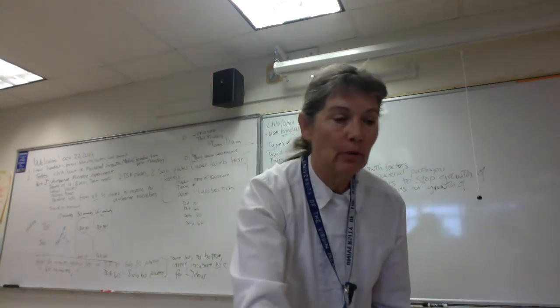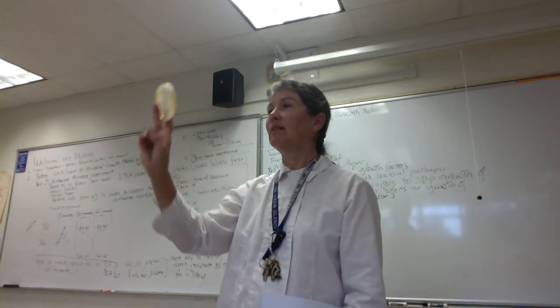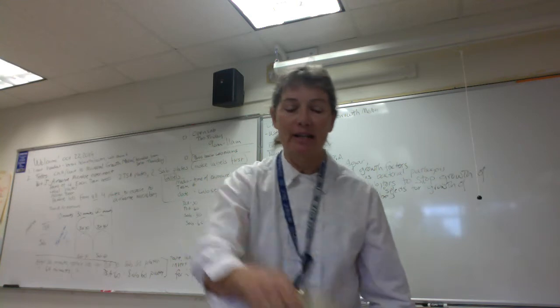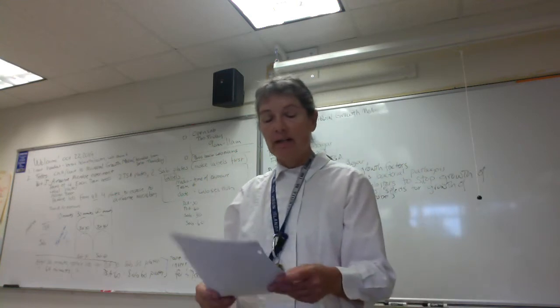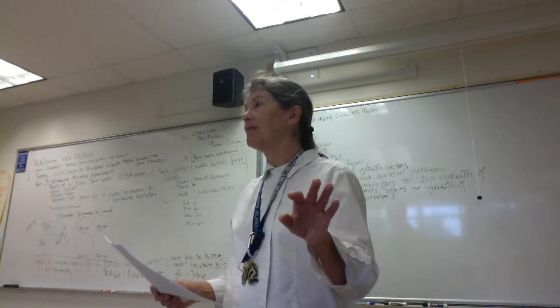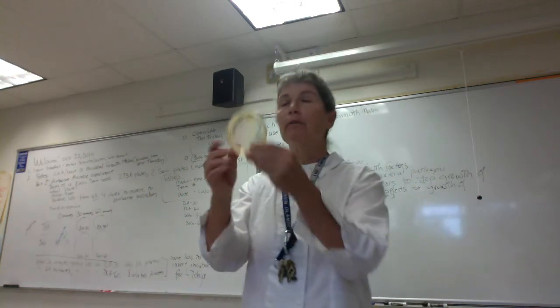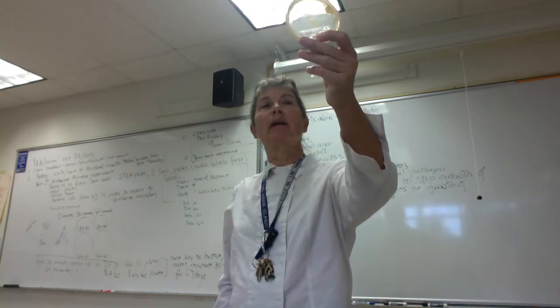And folks, if we pour the agar into a petri dish and let it solidify, what do we have? An agar plate. Good. Good job. All right. Now, the advantage, folks, of agar, and for me specifically agar plates, is that first of all, we can see if microbes have grown.